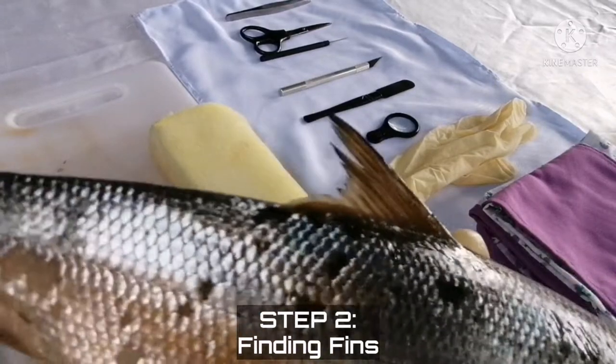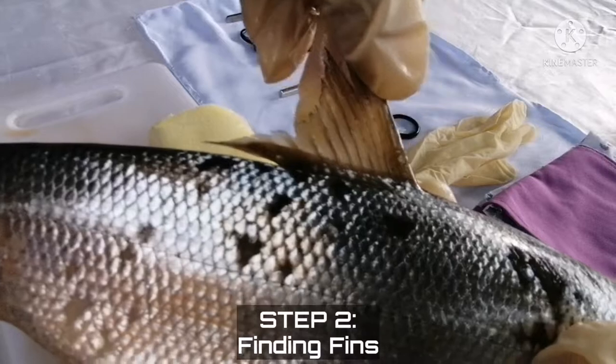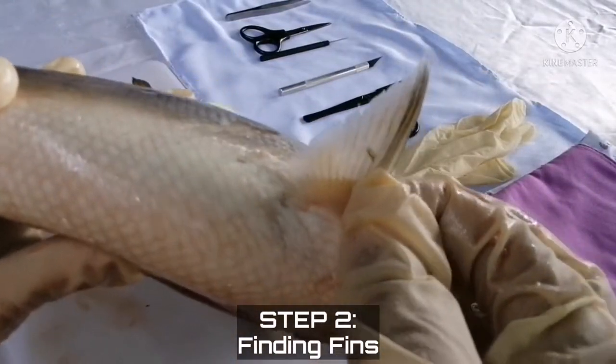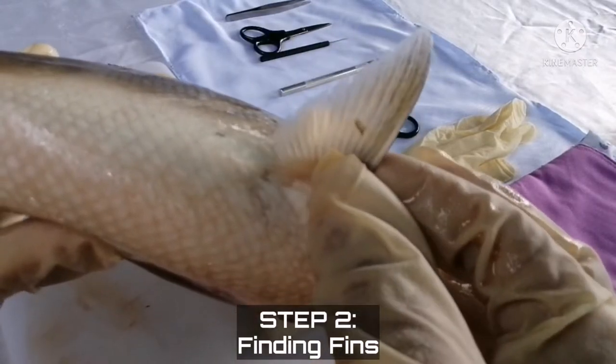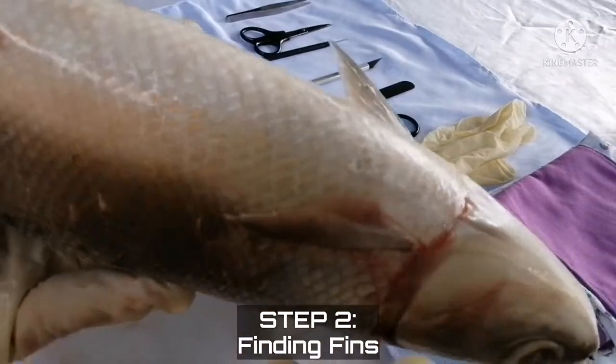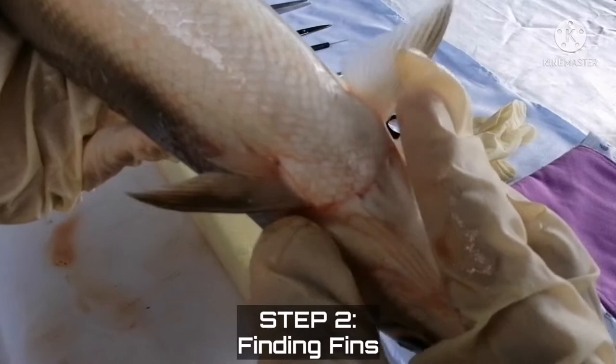First is the dorsal fin that is found at the top of the milkfish. It is used to stabilize the fish against rolling and to assist in sudden turns. Second is the pectoral fin that is found at the chest level. The two pectoral fins are responsible for control of directional movement up and down or side to side.